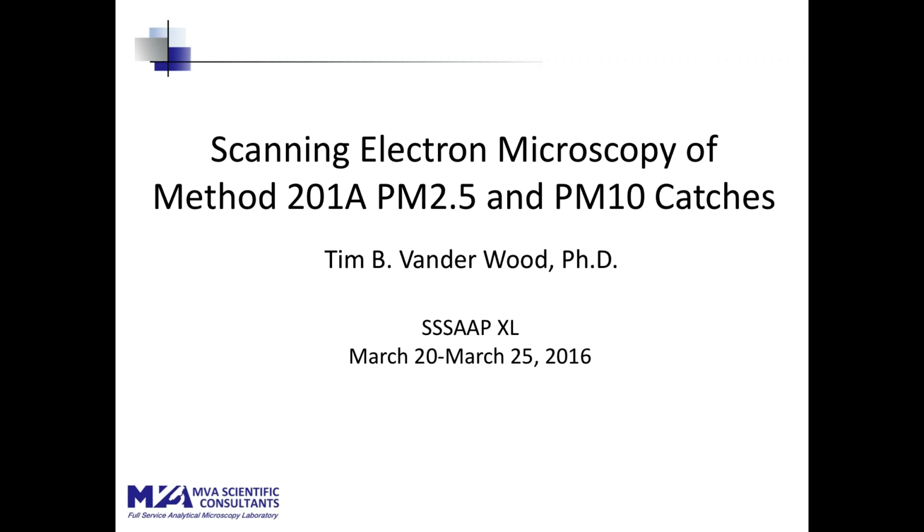I began my talk last week by admitting my prejudices. I have, for something like 40 years now, been characterizing particulate samples and individual particles using microscopy and many other techniques. And when I came to the stack testing industry, I was amazed that someone would characterize a particulate sample by weighing it. There is so much more information to be learned that I thought we would talk something about what we can learn about particulate samples, and we would use as an example method 201A catches, both the PM2.5 and the PM10 fractions.